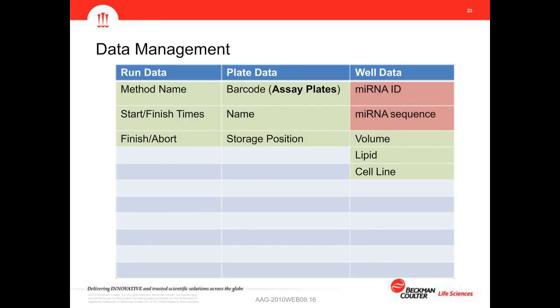So as Tim mentioned, this gives you an idea of what the repository would have in it now. Again, we have brought that information that we originally imported, still shown in red. That has been brought forward to the new assay plates and linked to the barcode, as well as updated information from the process, such as what lipid was added and what cell line was added, as well as having new updated volumes for all the library and assay plates.